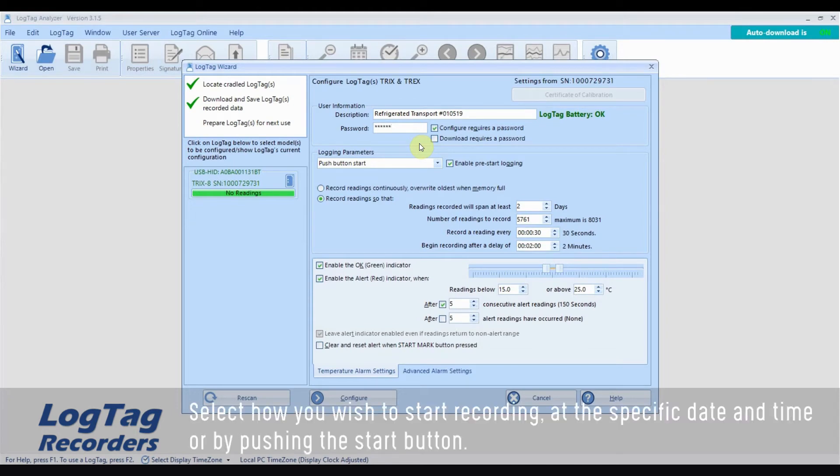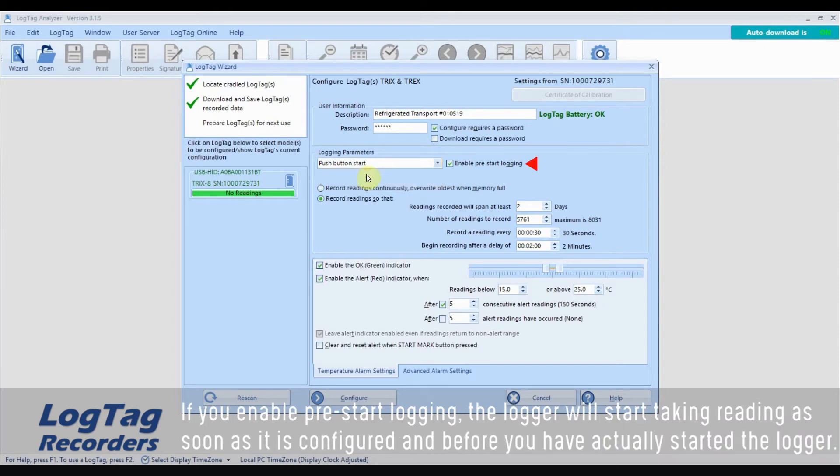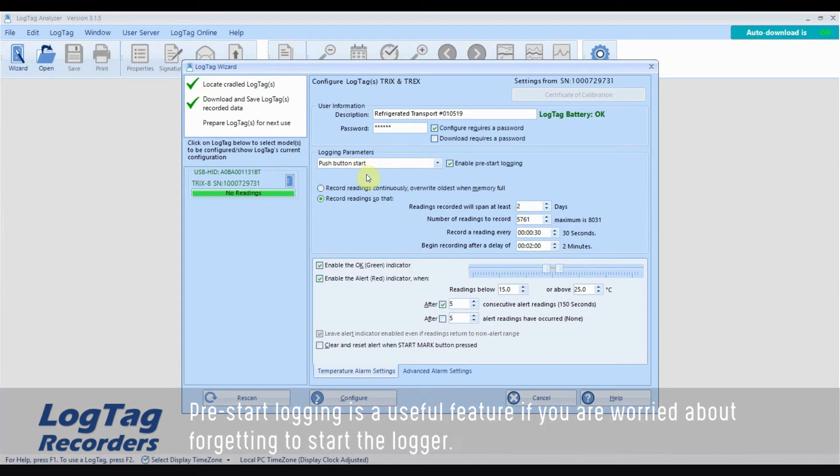Select how you wish to start recording, at a specific date and time or by pushing the start button. If you enable pre-start logging, the logger will start taking readings as soon as it is configured and before you have actually started the logger. Pre-start logging is a useful feature if you are worried about forgetting to start the logger.